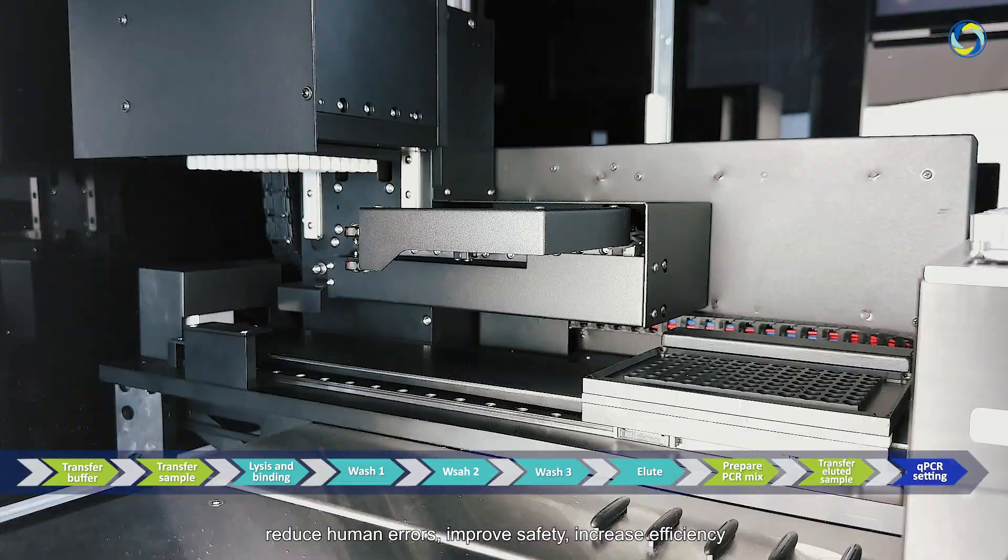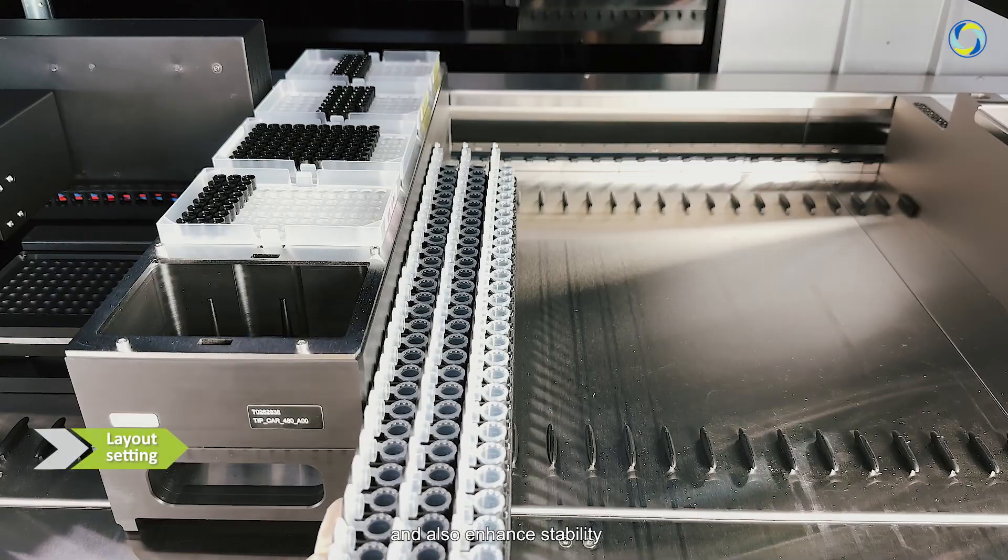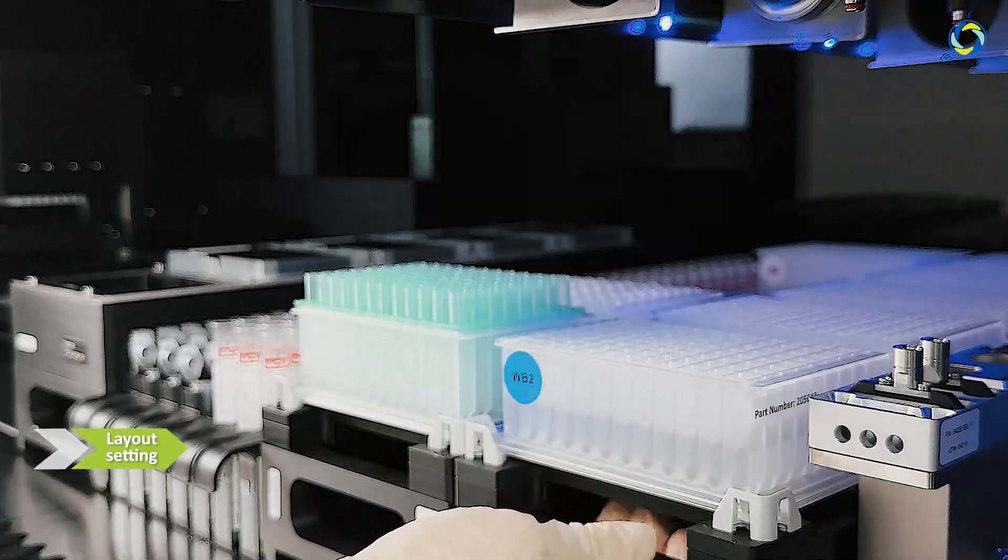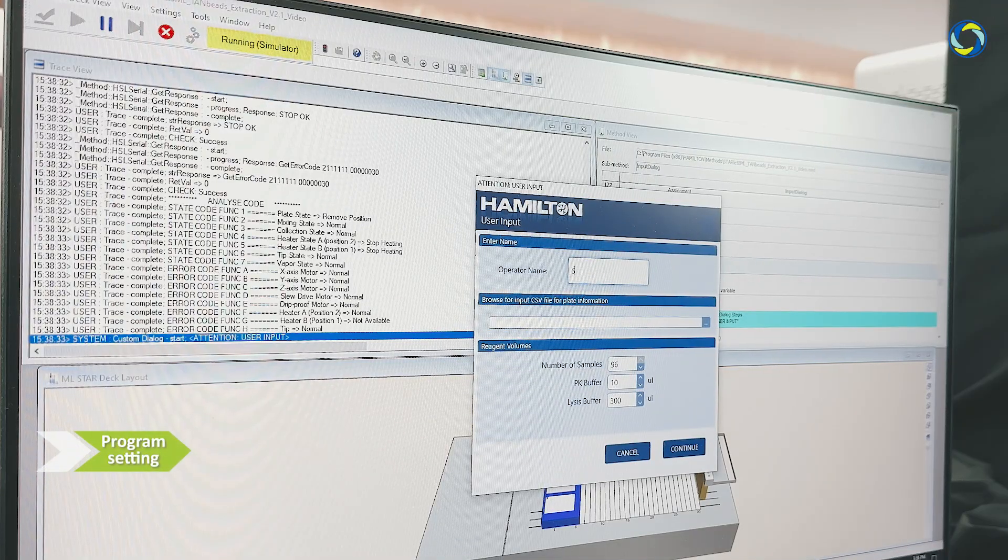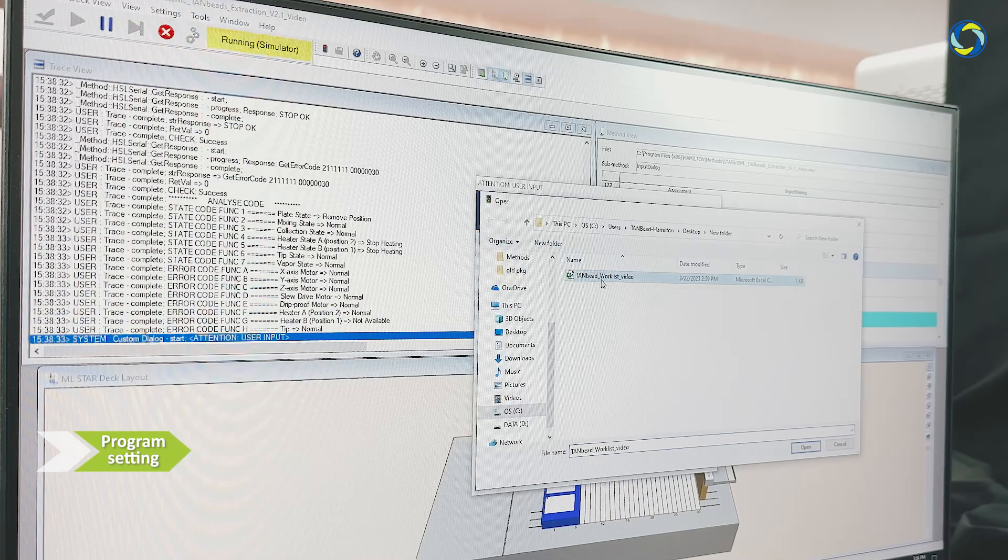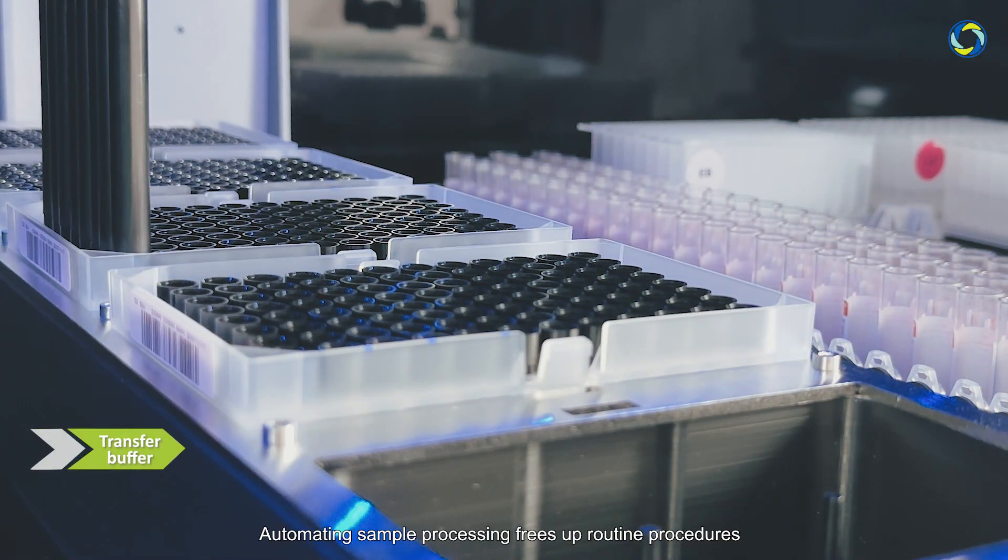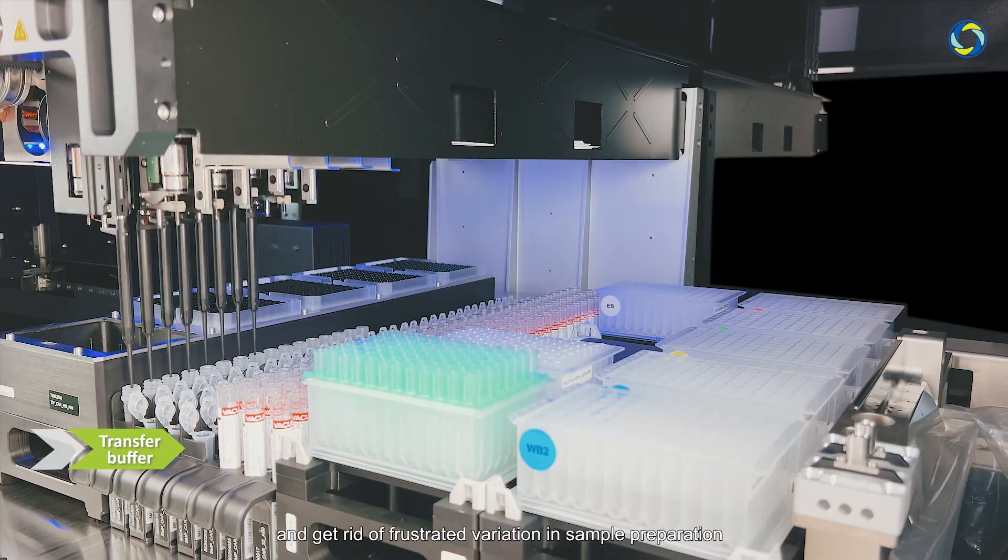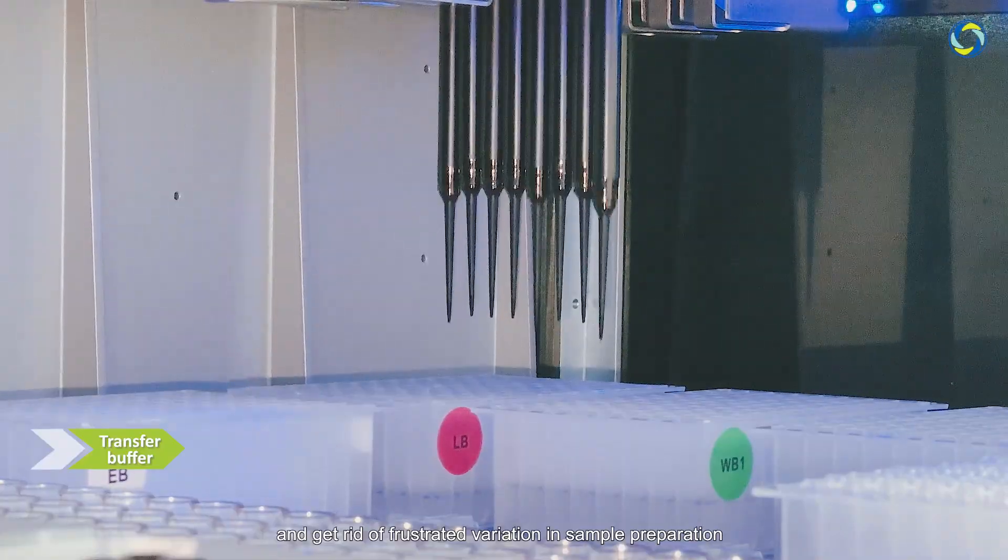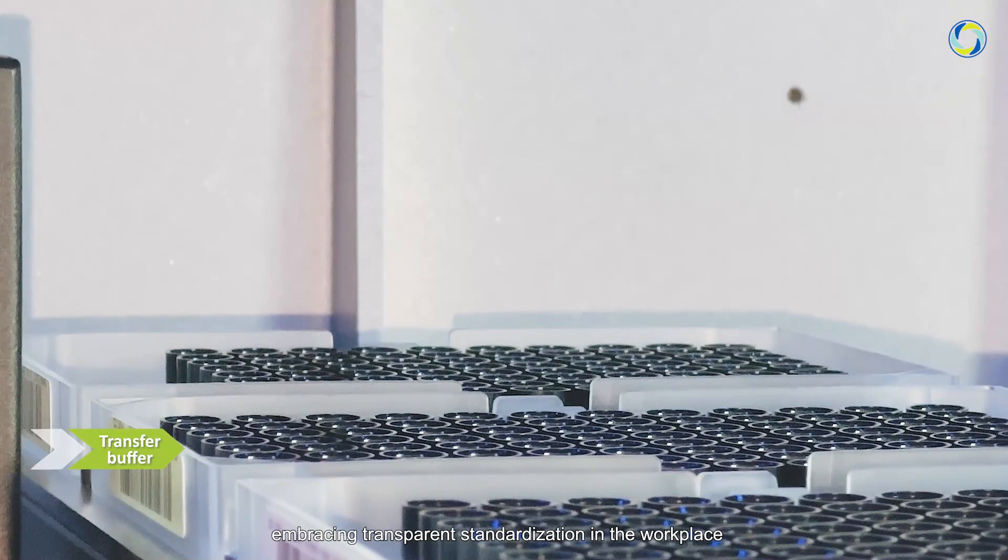Automating sample processing frees up routine procedures that help labs produce reliable and reproducible data and eliminates variation in sample preparation, embracing transparent standardization in the workplace.